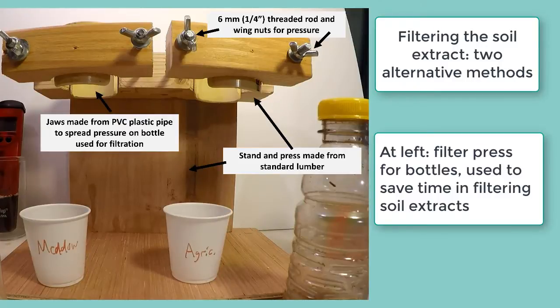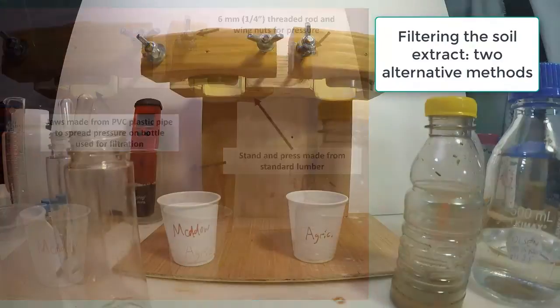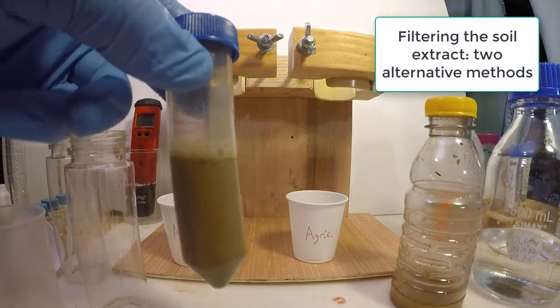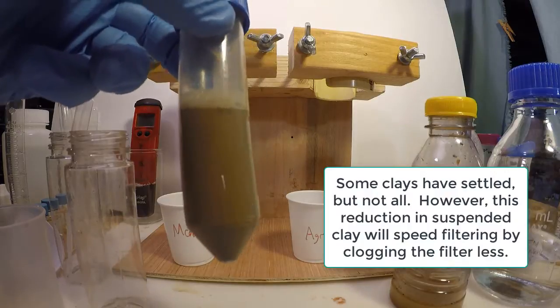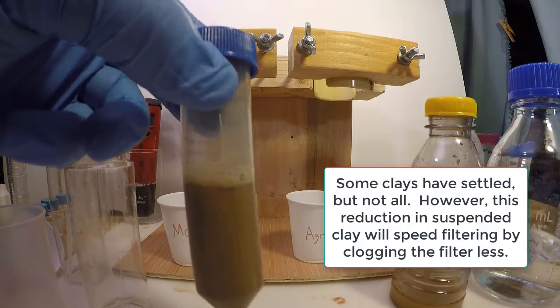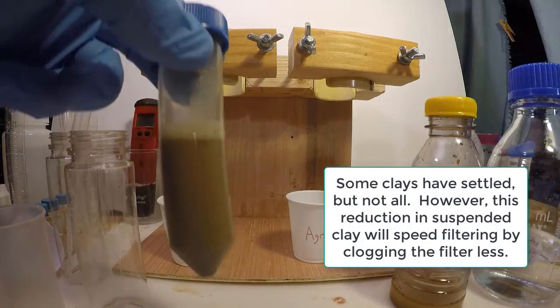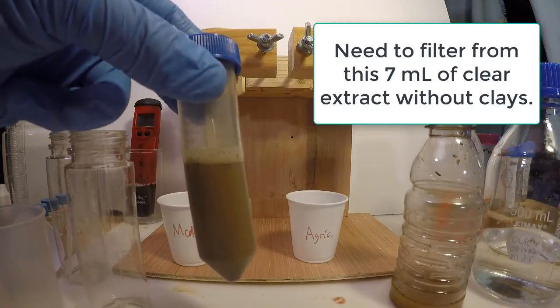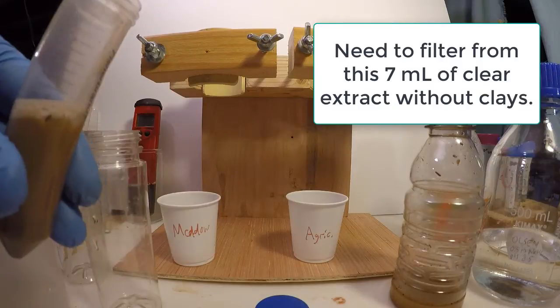Now we need to filter the soil extract to get rid of any clays not removed by settling. We'll describe two alternative methods for doing this, and for either of these it may be helpful to build a simple bottle press shown in the following video. The first method is more fail-safe but slower and requires a lab-quality filter. The second is faster and uses cheaper coffee filters but may become too slow for high-clay soils.